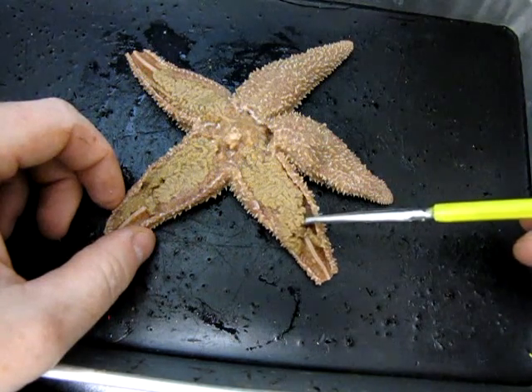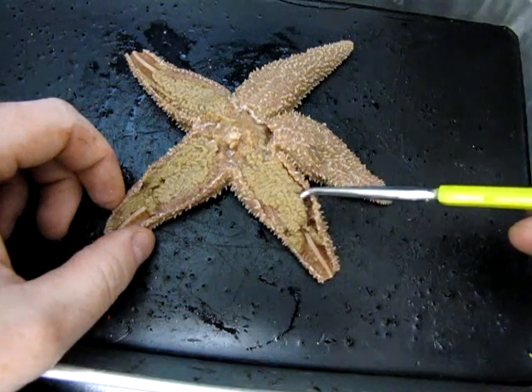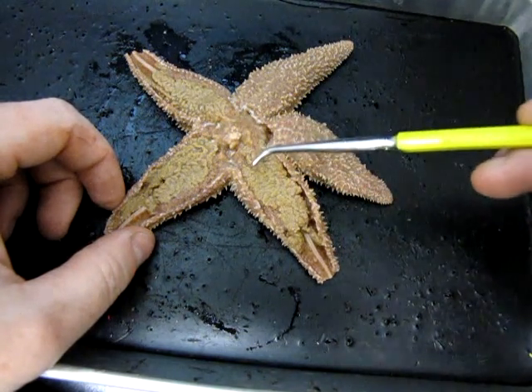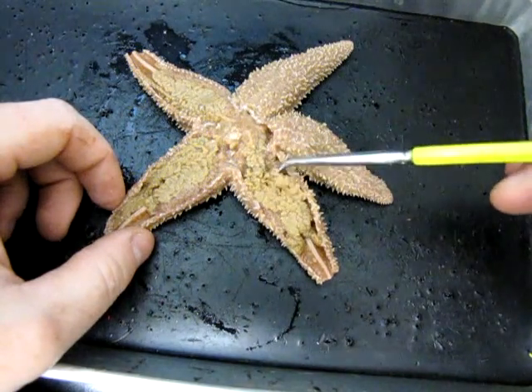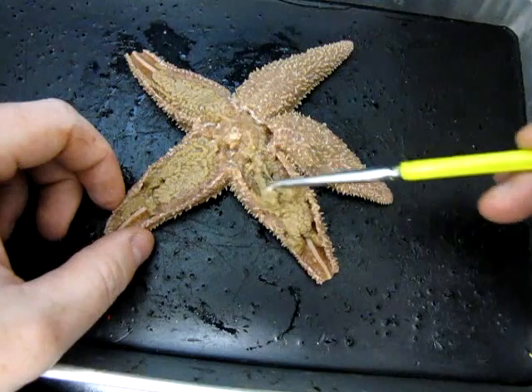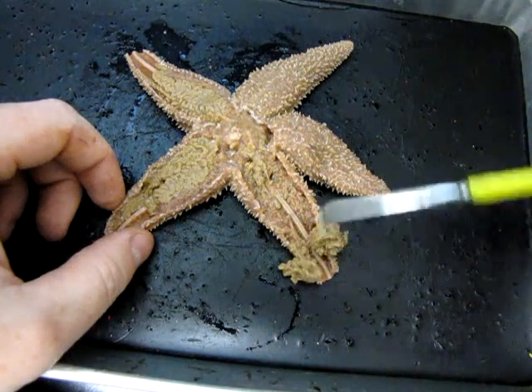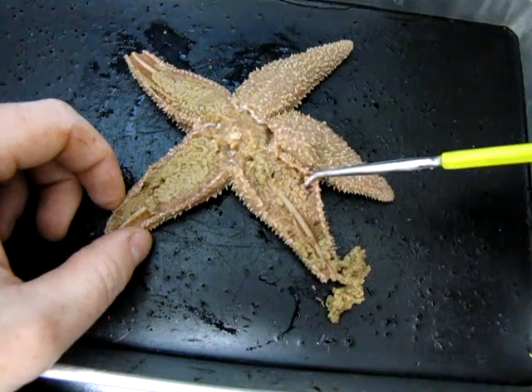The pyloric caeca function basically as a liver — they secrete digestive enzymes that the stomach is then able to use to break down food. I'm going to actually remove the pyloric caeca from one of these arms, tease that off carefully, and get that out of the way so we can see what's underneath.